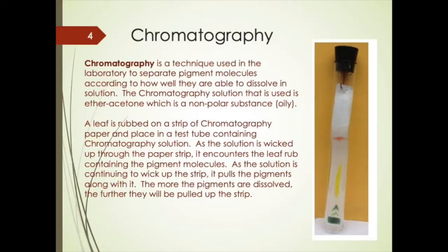The first experiment in your manual is the chromatography experiment. This is a technique used to separate pigment molecules. So in the chloroplasts there are these different pigments, right?